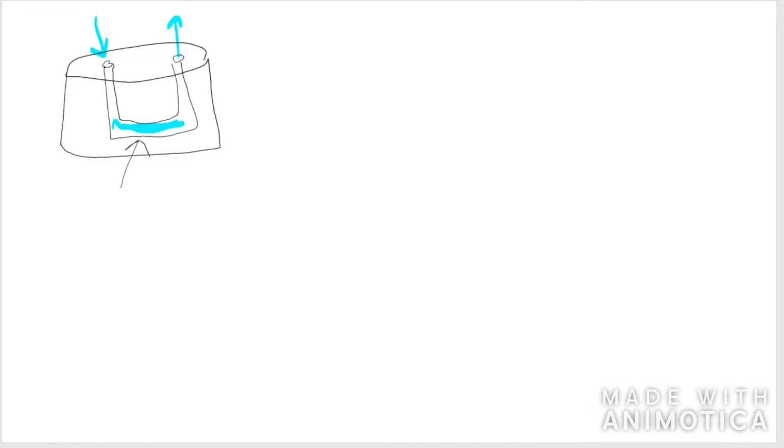And since the volume of fluids that are run through these microfluidic chips is very small, for example, maybe the droplet that you want to conduct testing on is only 1 microliter. If there's any variation in this volume, then the test results could be incorrect, given that maybe it's smaller.